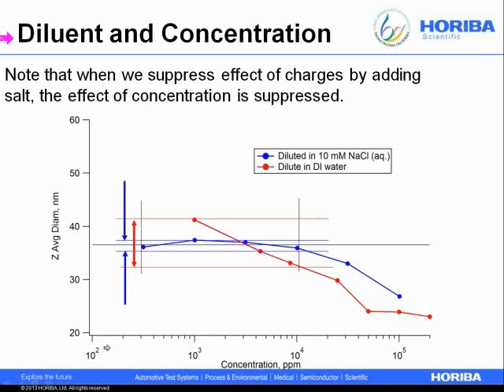So on the left, I plot the measured z-average diameter, or size, again as a function of concentration. Now notice that this is much smaller. This is only 30-odd nanometer size, and my range of concentrations is higher because I wanted to get a nice strong scattering signal for this plot. Now the red, you can see that the measured size just changes constantly with concentration, consistently going down over all the concentrations I measured. And so the range of sizes I see between this bar and this bar is quite wide.